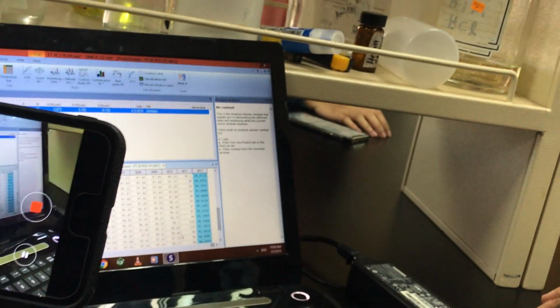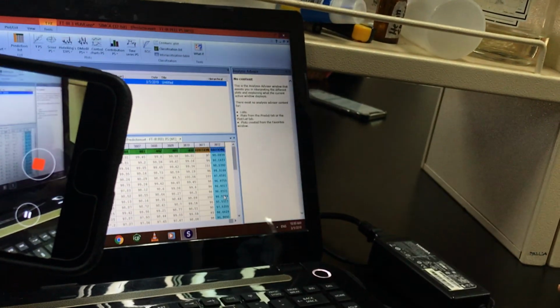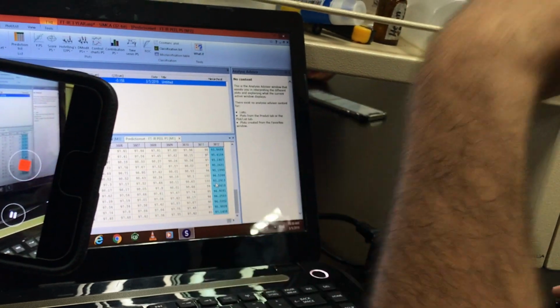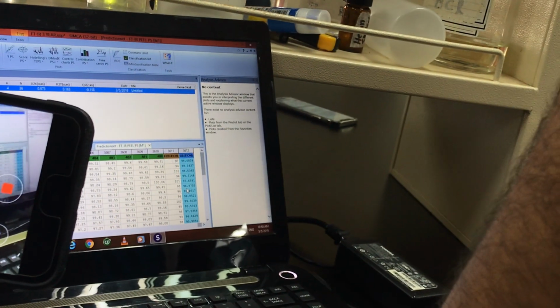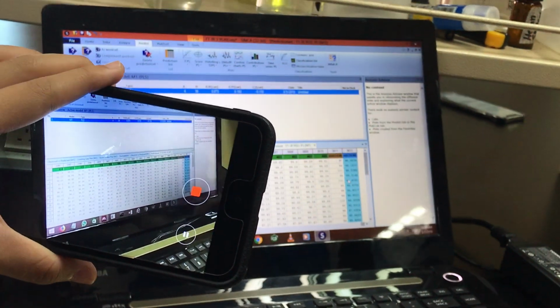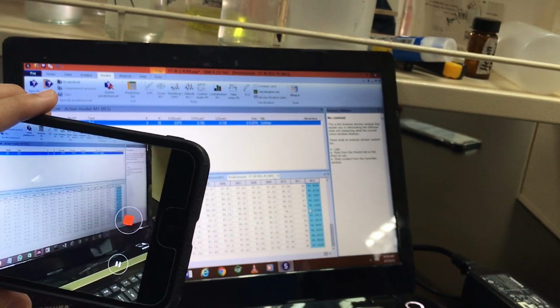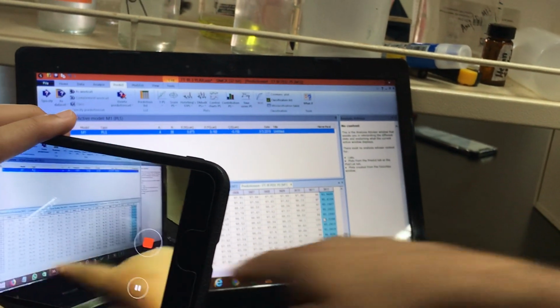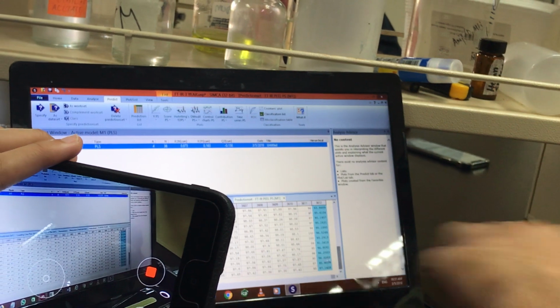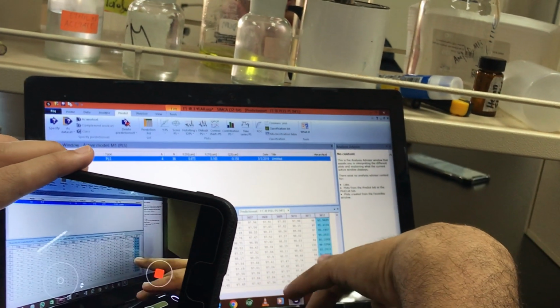You can see the prediction. So high, because almost all are the same. This is the prediction one, so our result for the prediction. Bring the external samples, you just add them here and there is no need to go to activity. You will have this prediction.